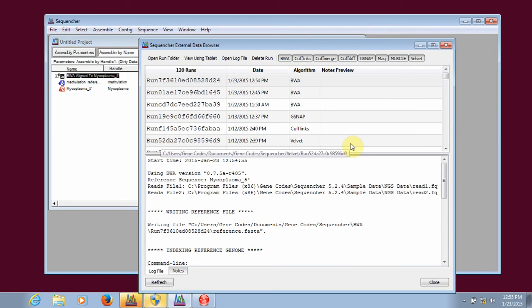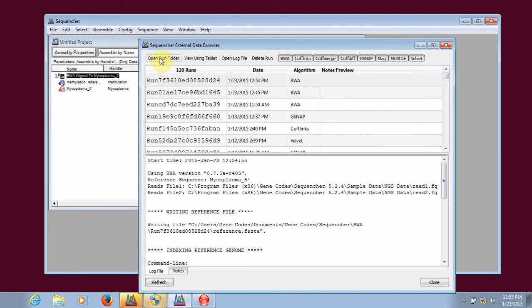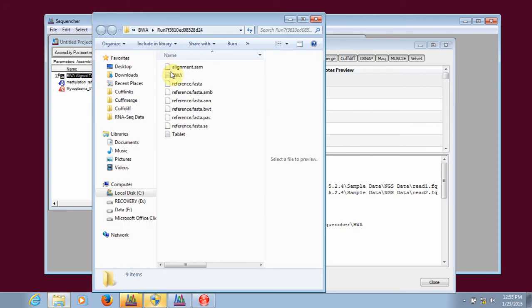We can also see the SAM file of our alignment in the external data browser. So if we click on Open Run Folder, it takes us to the folder for that run of BWA.